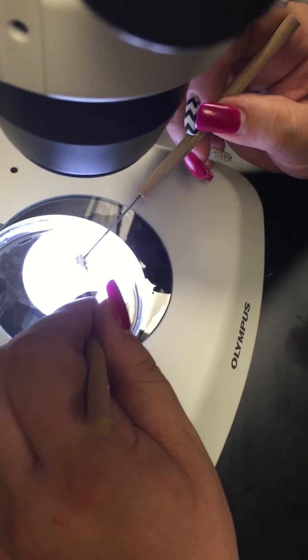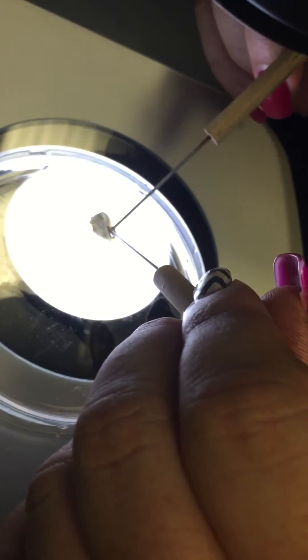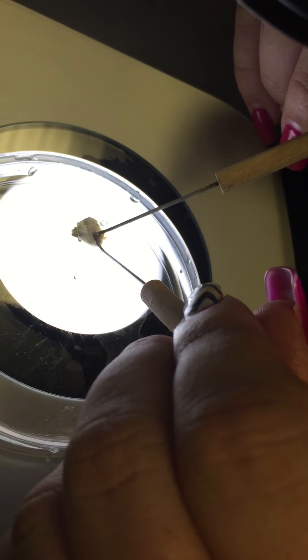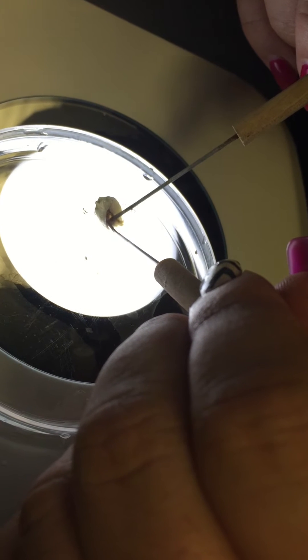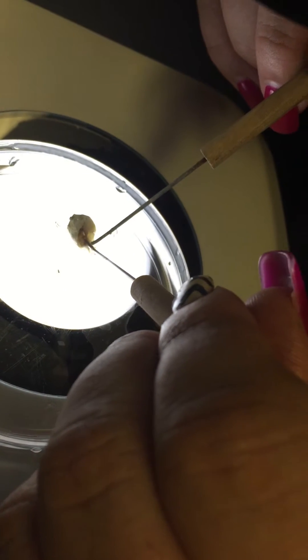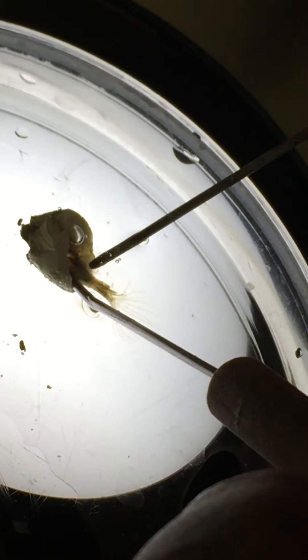The cilia are really delicate, so go towards the back and push them out that way. What you don't want to do is tear any of the cilia, so if it starts pulling up towards the cilia, let go. There you go, now pull them out.